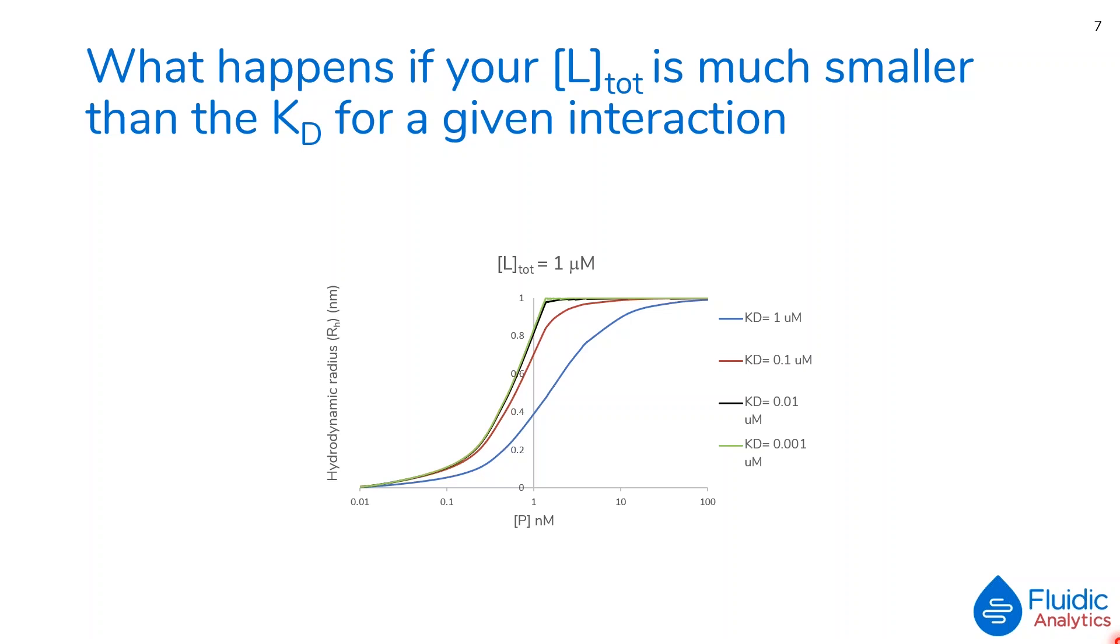Since these curves are so close and hard to distinguish, the graph presumes that the KD values must be close together, when we know in reality they are not. This illustrates why we should always use the lowest concentration of labeled species to ensure you get good discrimination for KD values.